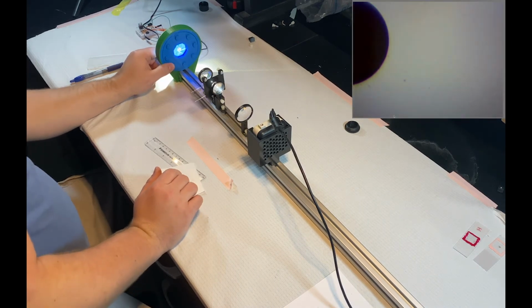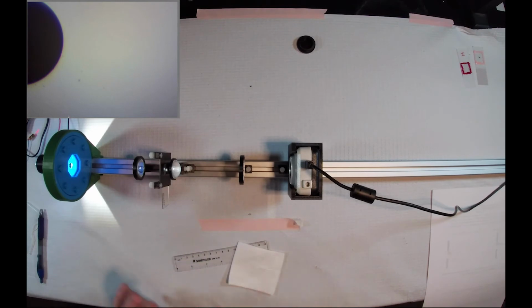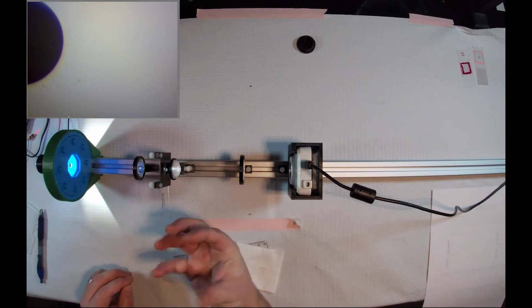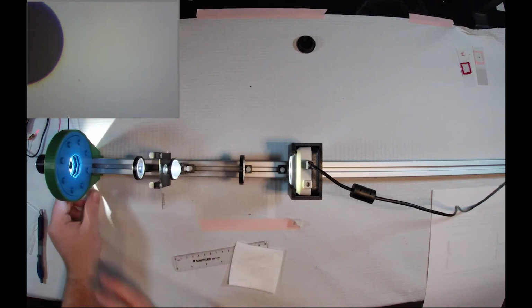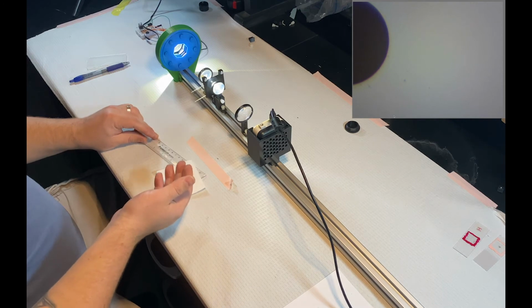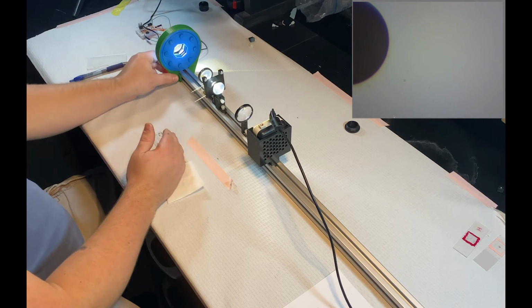So we can really sort of narrow down the total amount of our sample that is illuminated. And to my eye, I can see that as I open and close this iris, I am also opening and closing the amount of area of my sample that is illuminated. So this is useful for simply controlling the total amount of illumination that hits our sample. But when you are dealing with a system where you only have one iris, it's actually more useful to have the iris mounted at what is known as the aperture stop.